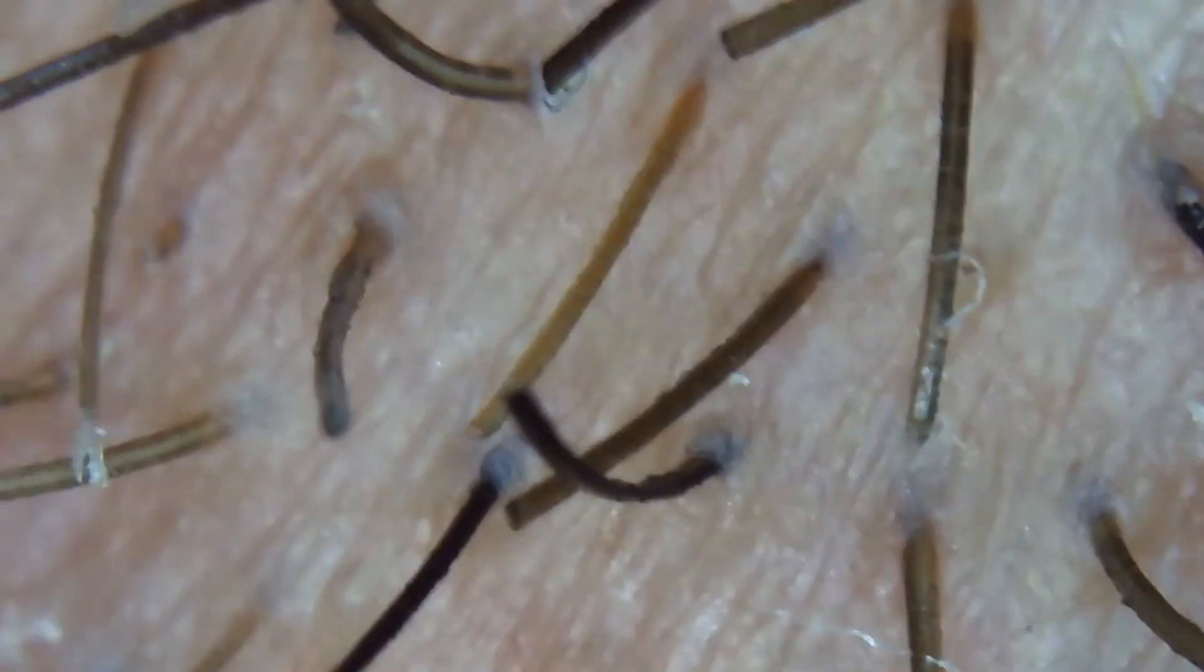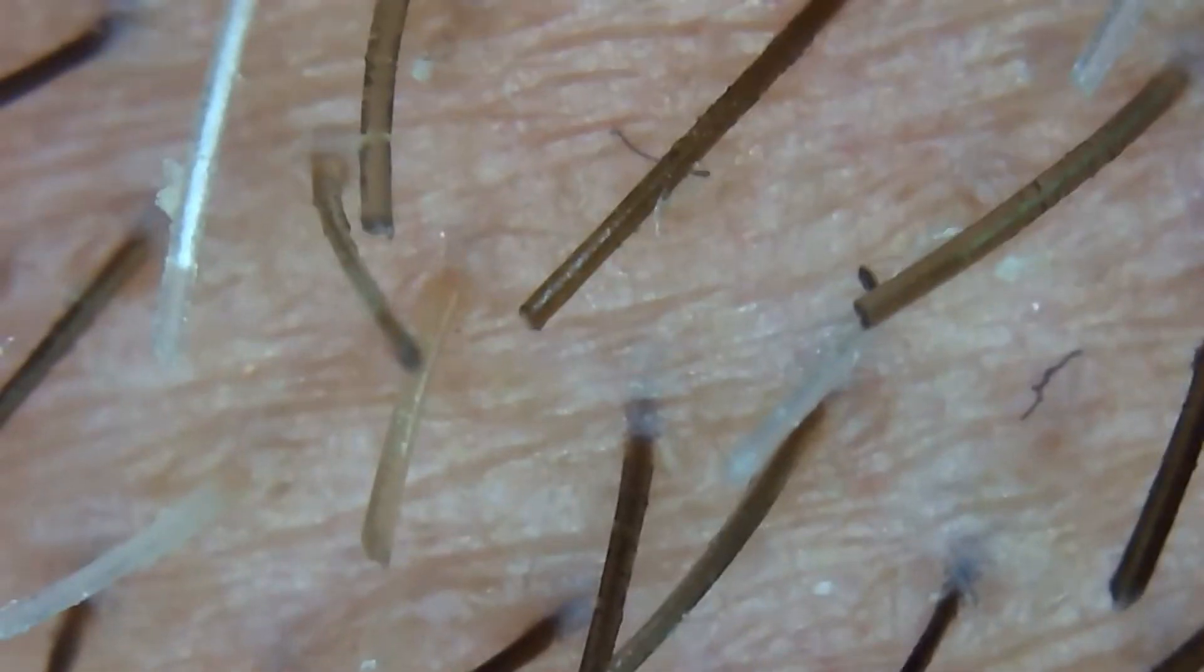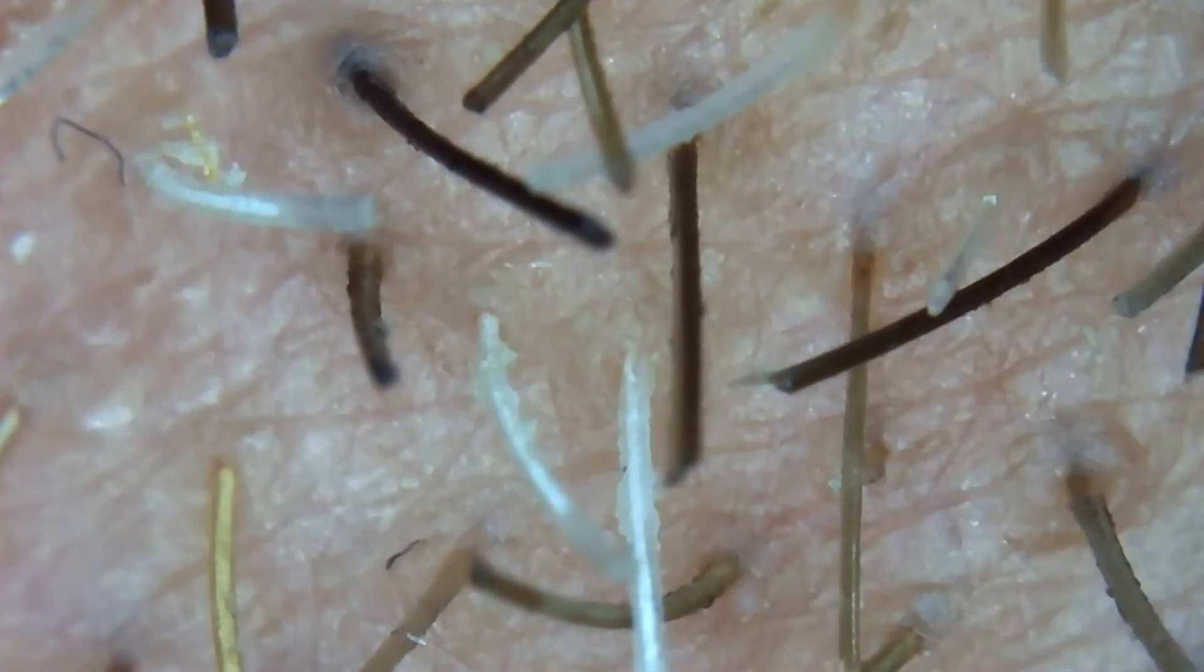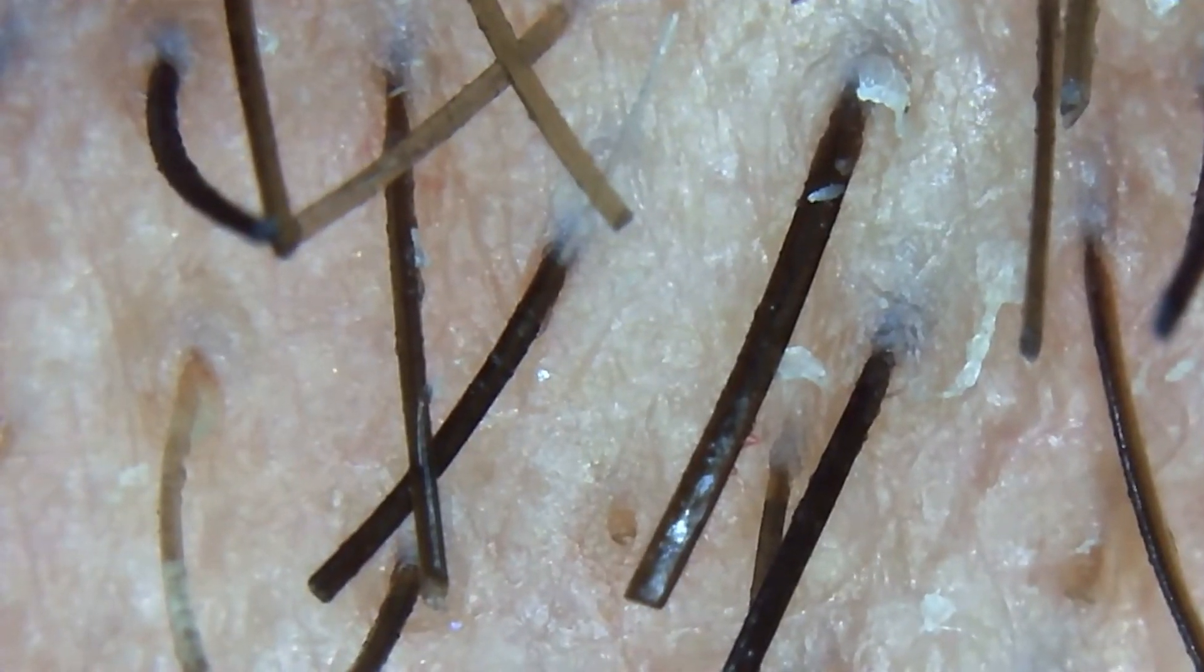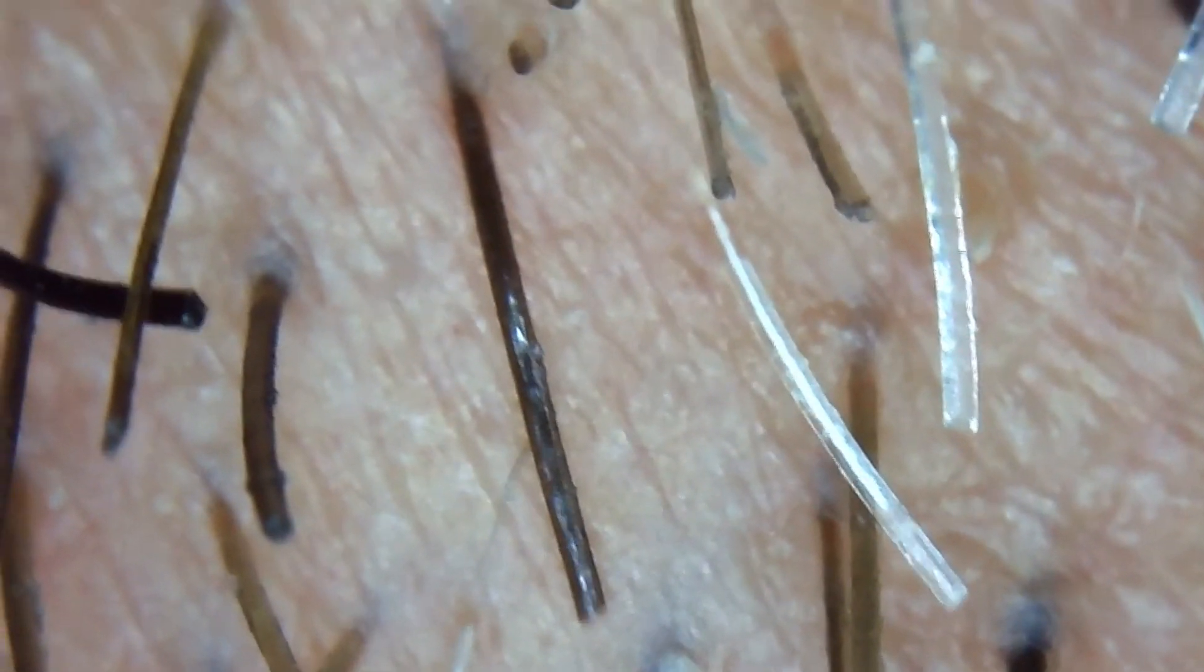We go directly to the maximum zoom. We can see that my beard at least has different colors. Some are white, some are light brown, some dark brown and some straws are almost black. Look like glass almost, or wood.